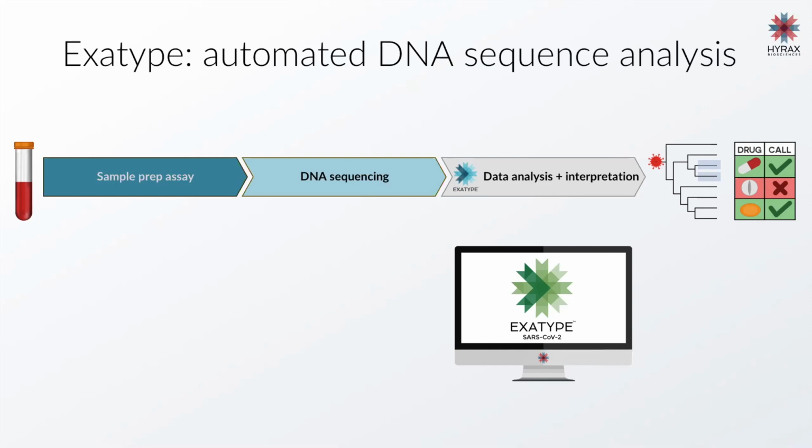For those of you that are experienced with software analysis, you'll see that a lot of the software solutions that are available are either incredibly complex or complicated to run, or have a lot of manual steps in running the data and running the analysis. Really for us, the ultimate goal is that at scale there would be no need for end user interaction, particularly because manual interaction unnecessarily introduces the threat of human error, but also impedes scaling.